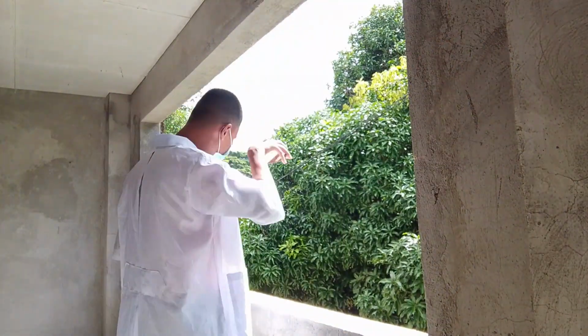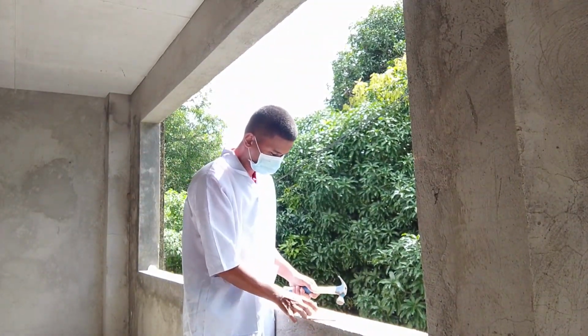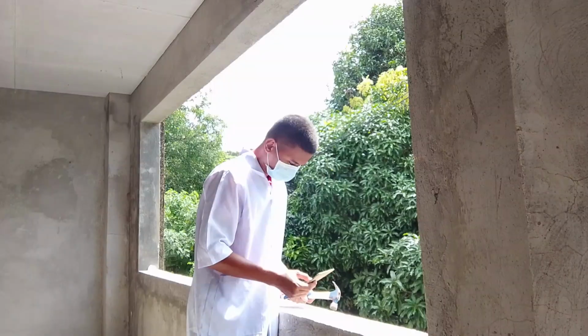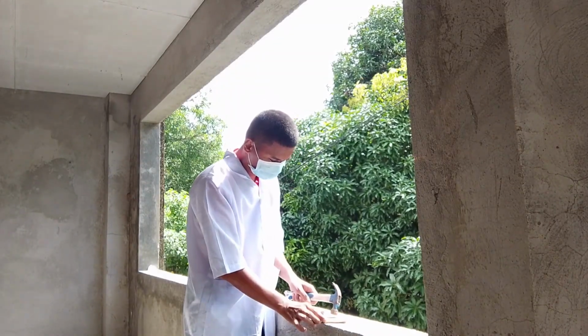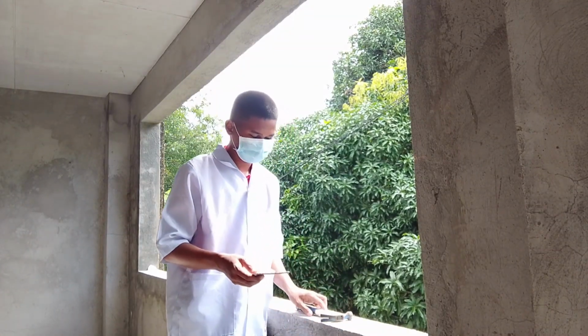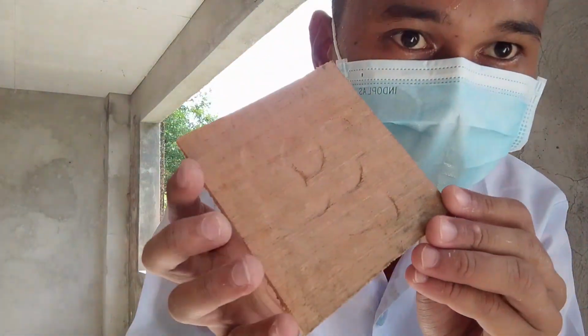I will first make a negative impression using the hammer. Here's the negative impression.